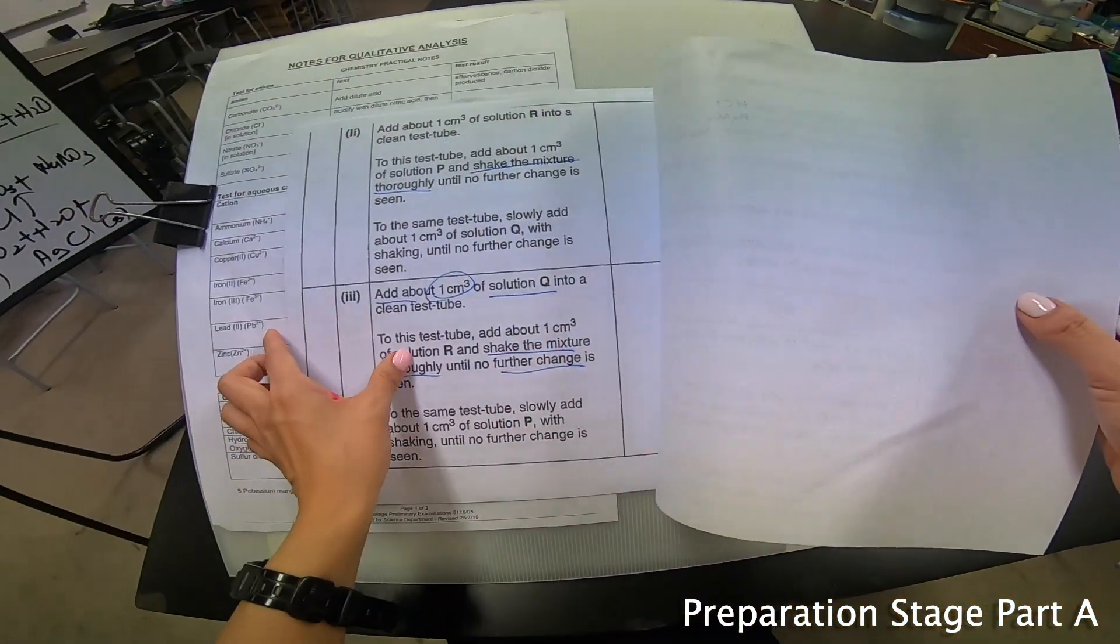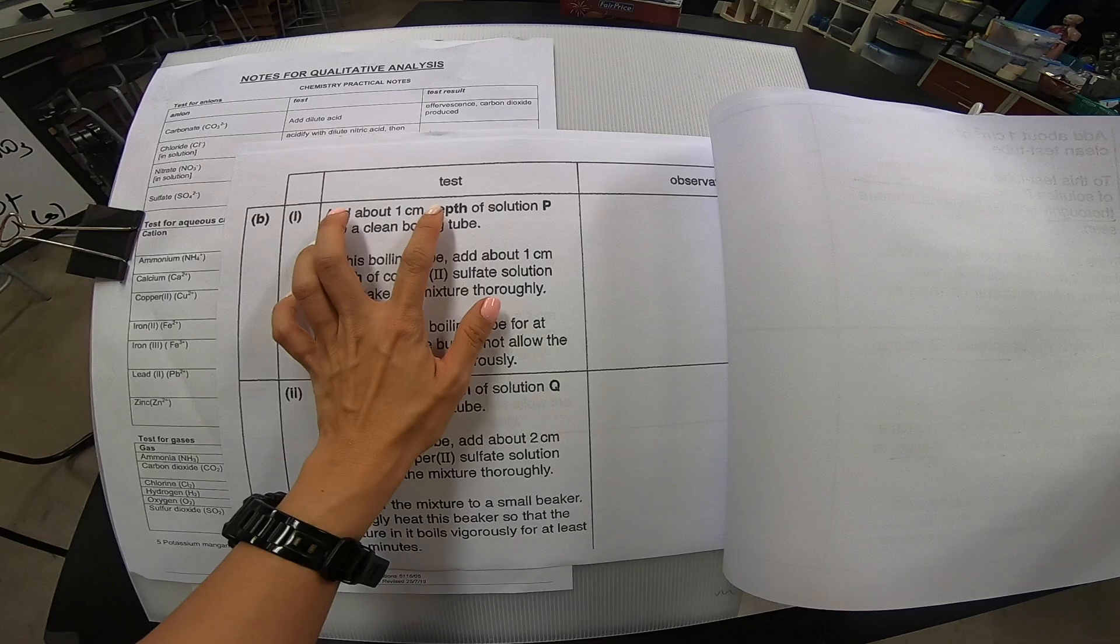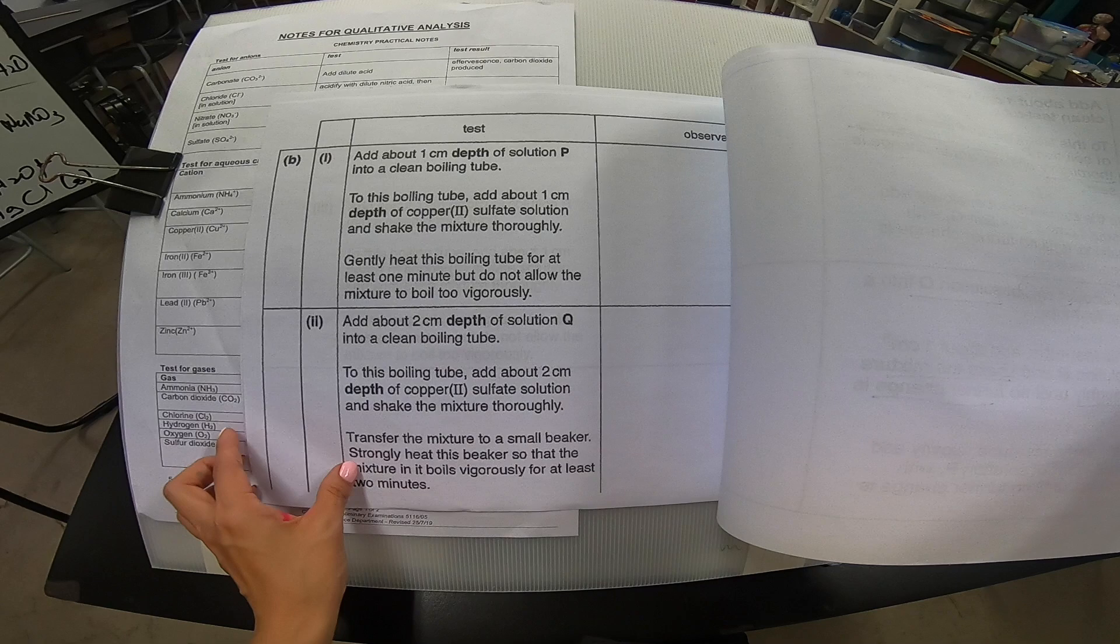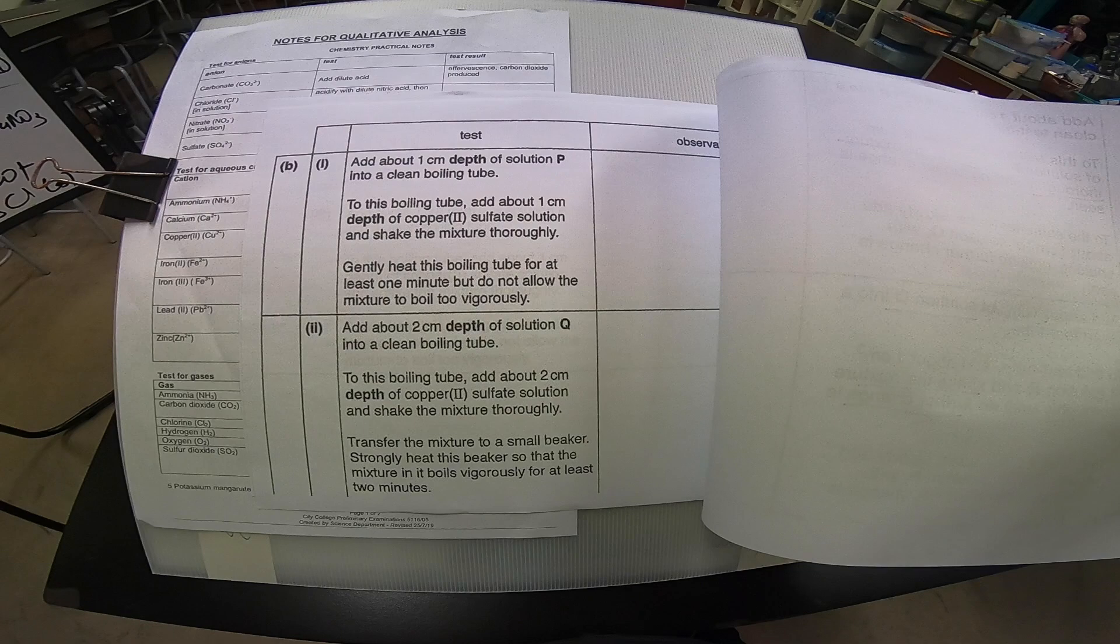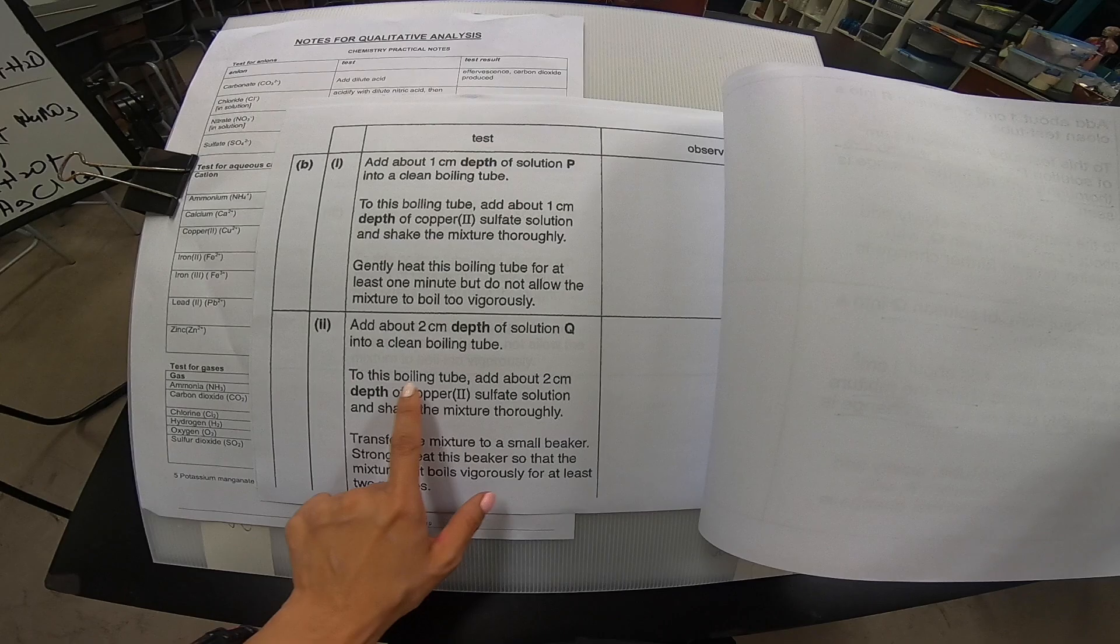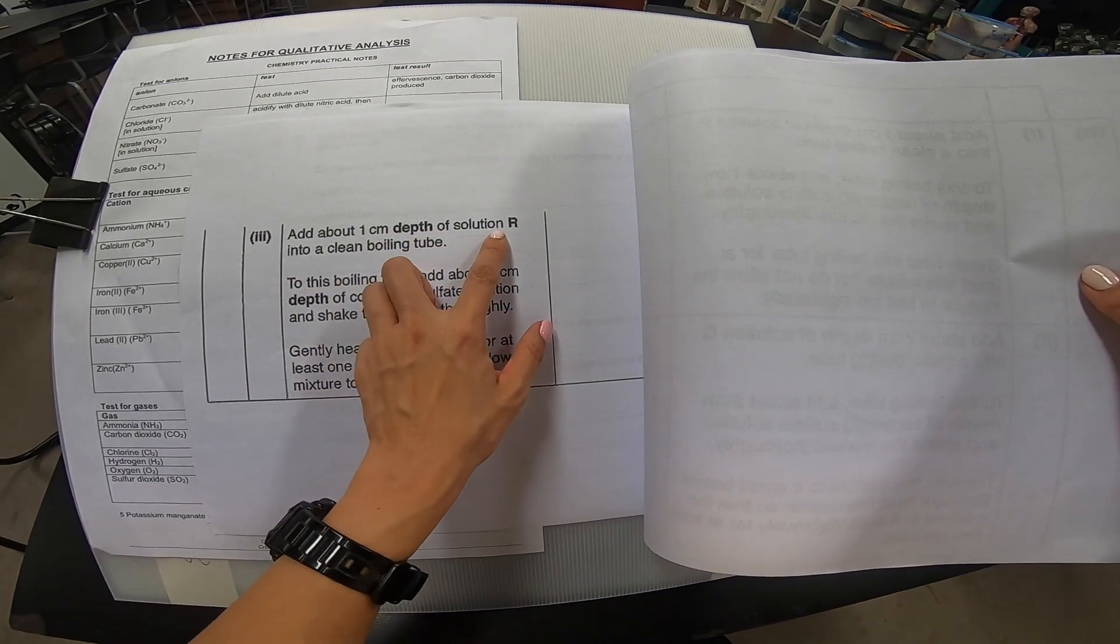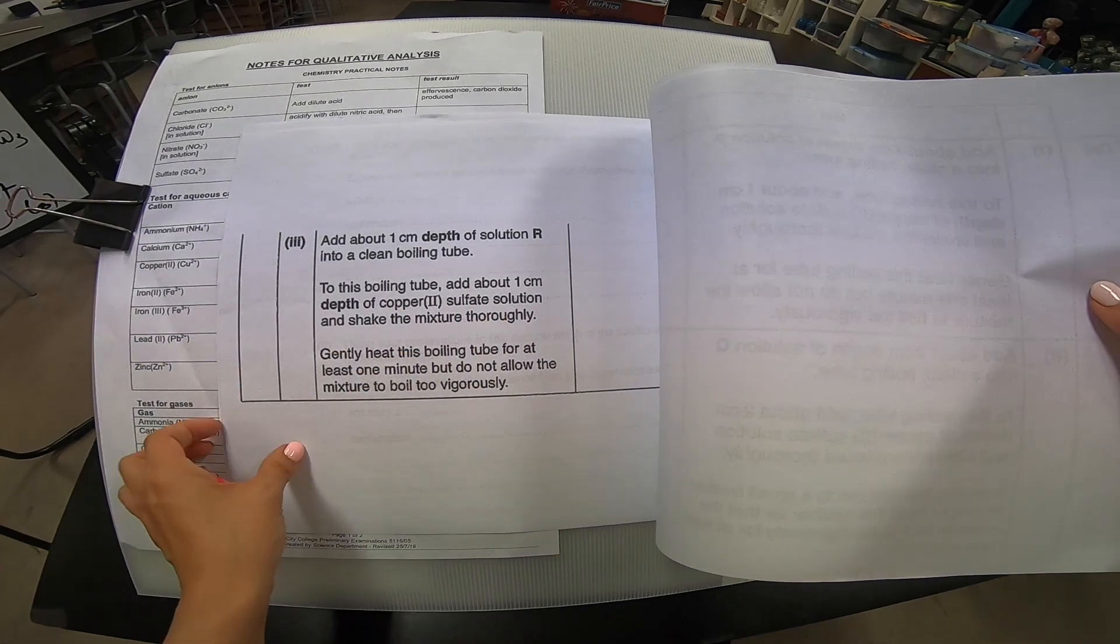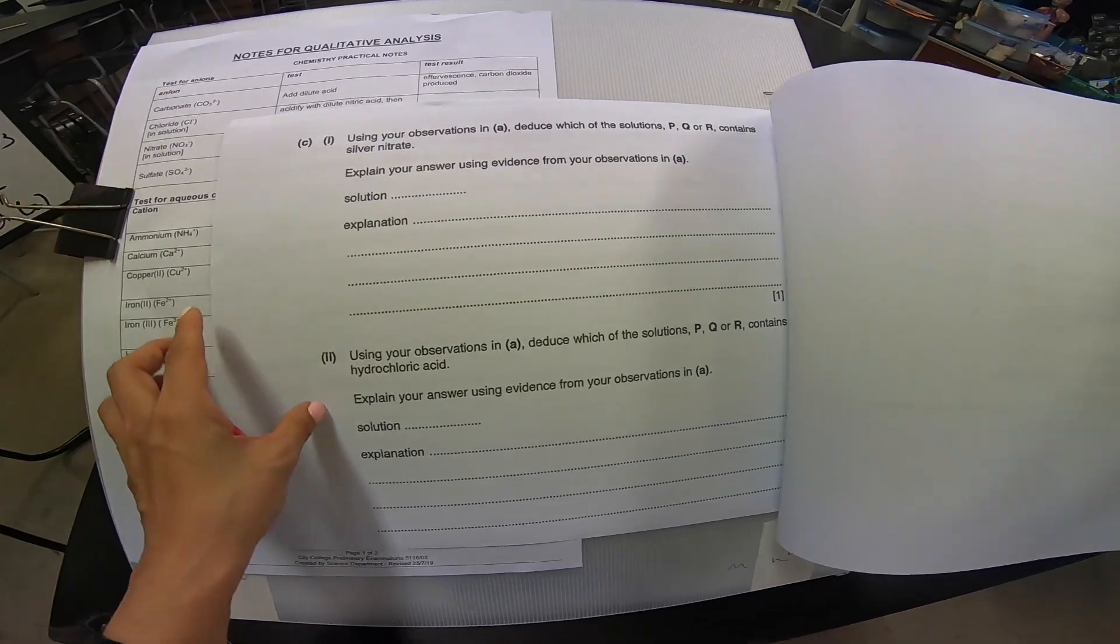Same thing, Q, 1 cm³ of R, and to this, another 1 cm³ of P. Remember, all these are estimated, but I have them all written down already. Let me put this back. Coming back to here, let's see how much more preparation do I need to do. Now, to the next part, it seems like they say add about 1 cm depth of solution P into a boiling tube. And this time round, you add copper sulfate. It seems like this portion here, I have a quick glance over it. It seems that it's copper sulfate again. And then there's another copper sulfate again over here.